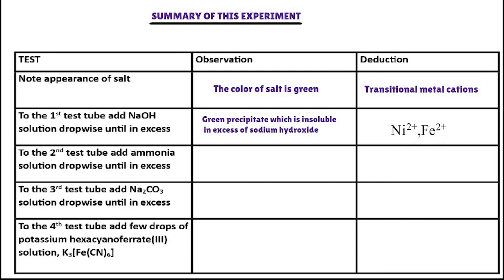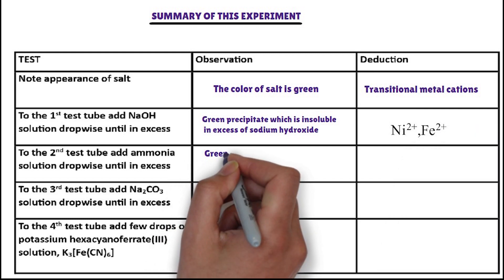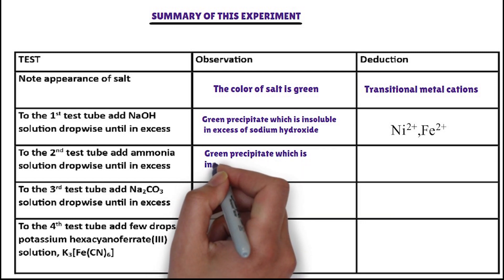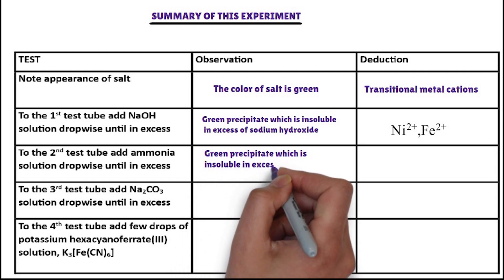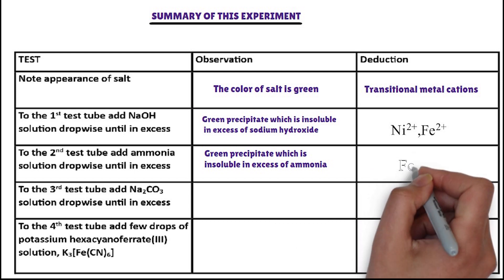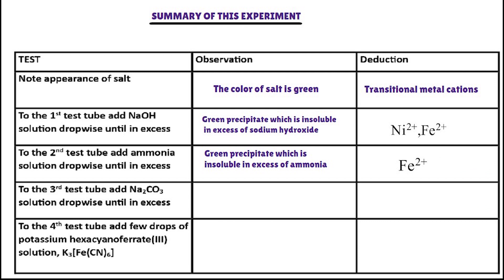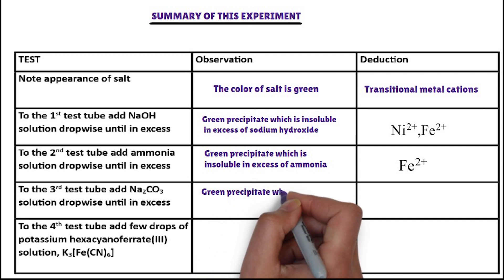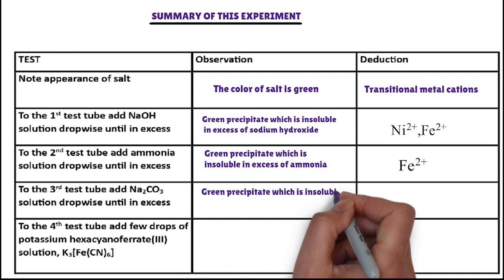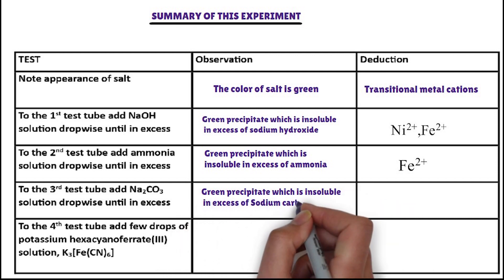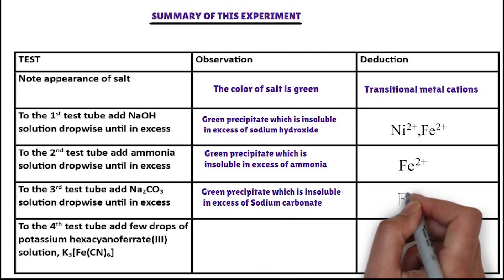In the second test tube, ammonia solution is added dropwise. The cation from the above cations that forms a green precipitate with ammonia solution, insoluble in excess ammonia, is iron(II) ion. In the third test tube, sodium carbonate solution is added dropwise. The cation that forms a green precipitate with sodium carbonate, insoluble in excess, is iron(II) ion.